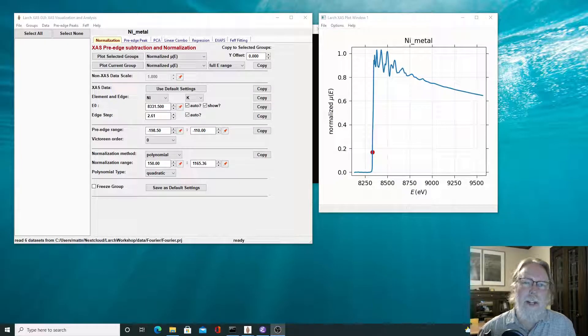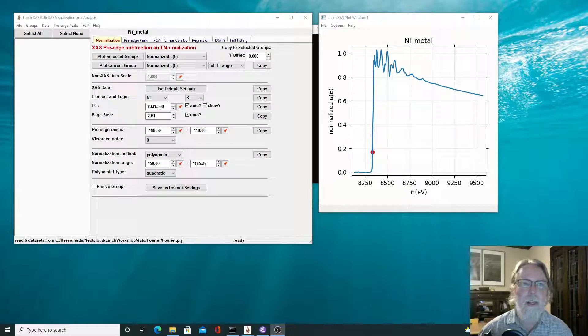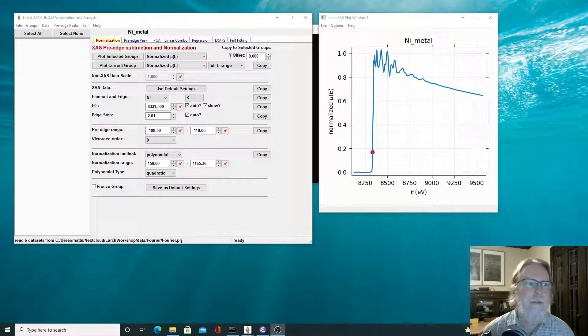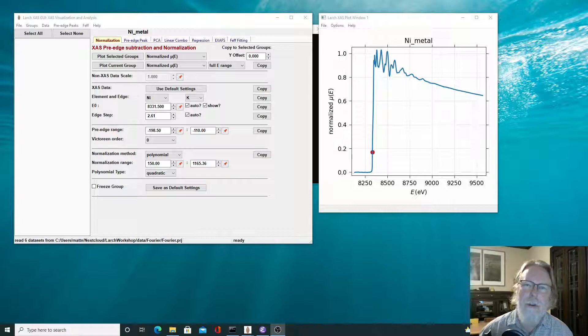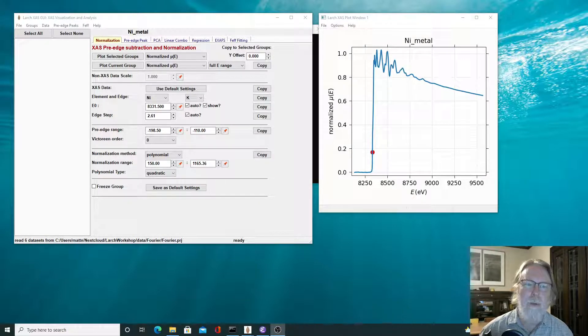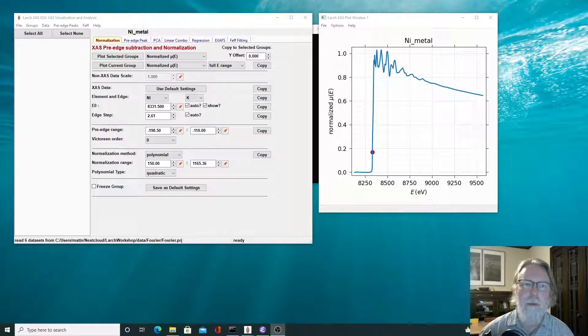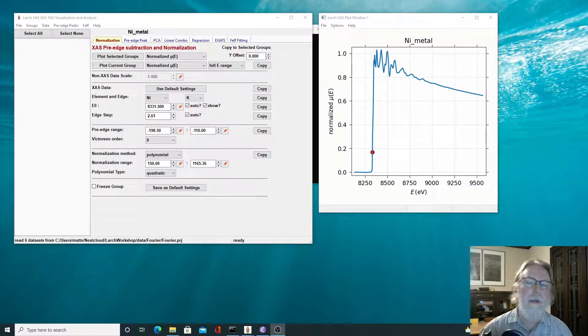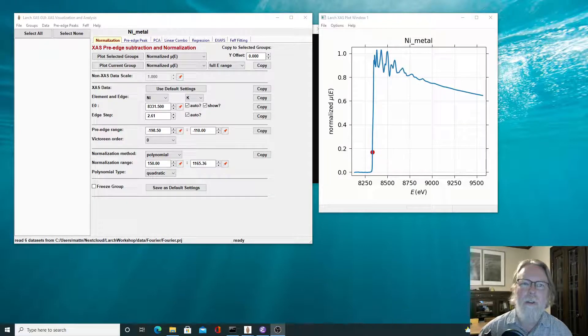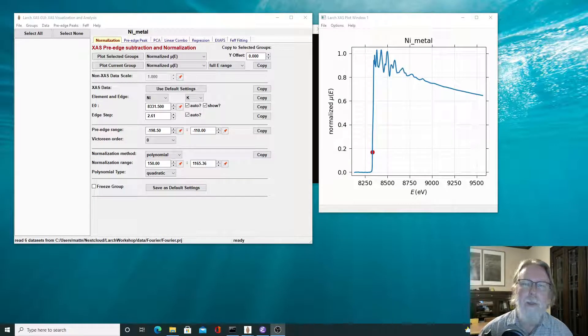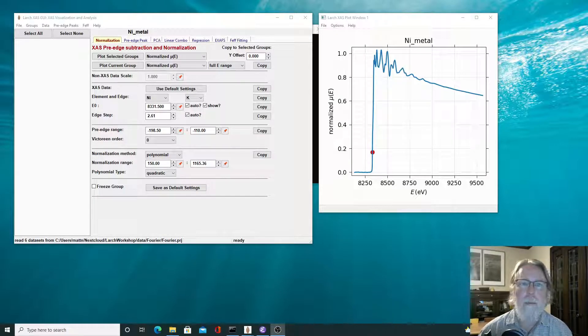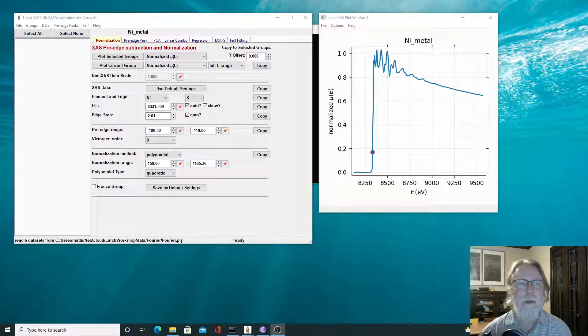To interpret extended XAFS data, the oscillations above the edge are separated from the slowly varying parts of the absorption coefficient mu of E. This is often called background subtraction and is an important step in the processing of XAFS data.